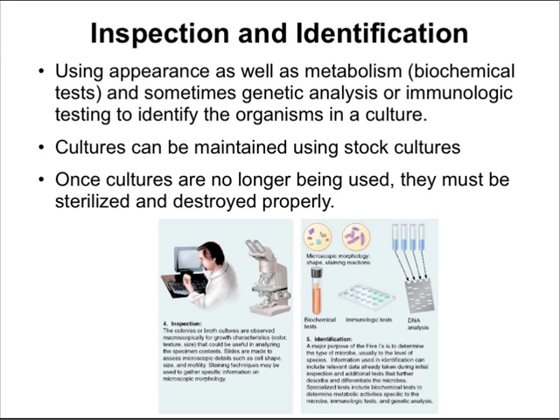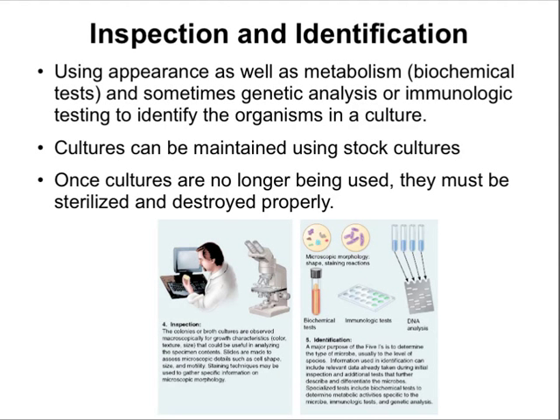Beyond that, we need to use these biochemical tests and genetic analysis or immunologic testing to truly identify the organisms that are in our culture. That's the identification phase. Once cultures are no longer being used, they have to be sterilized and destroyed properly.